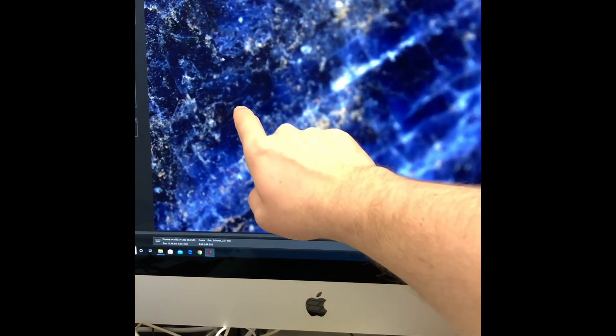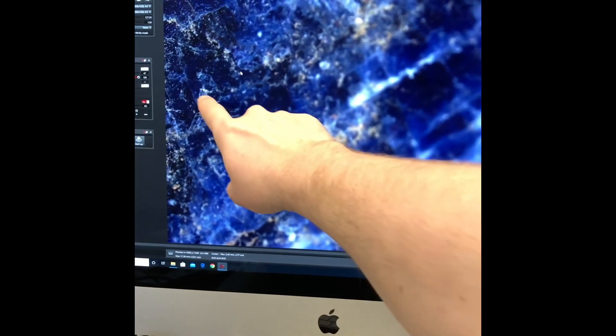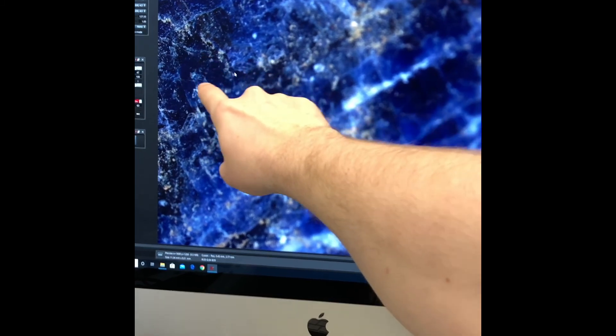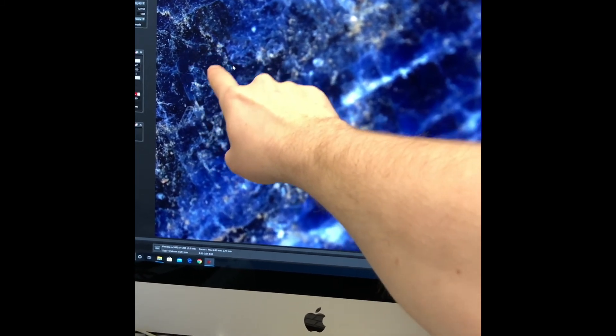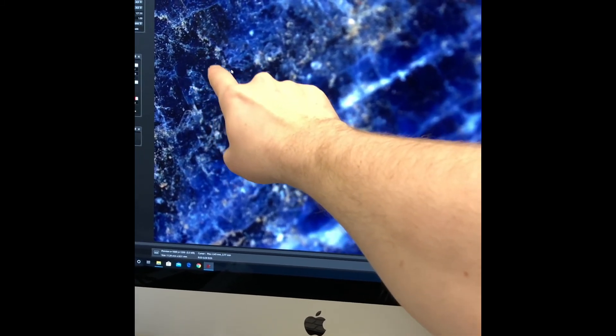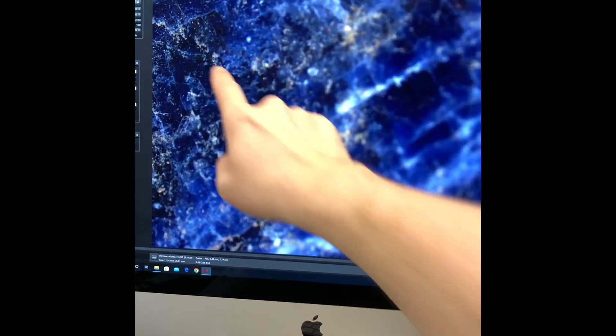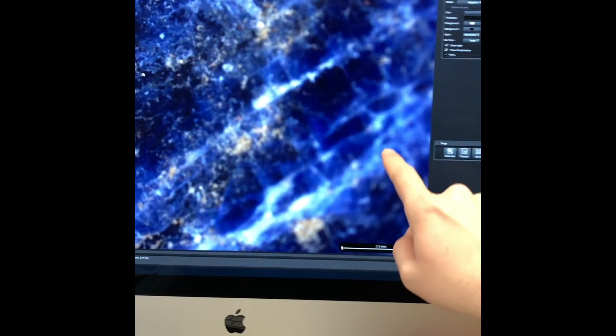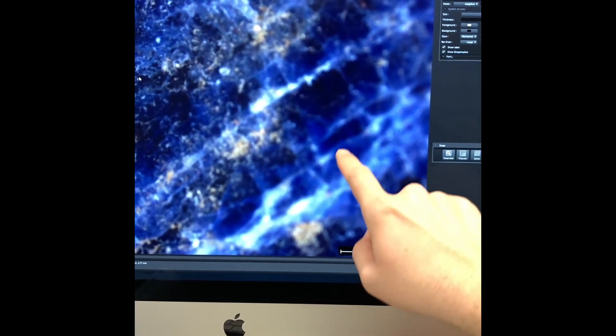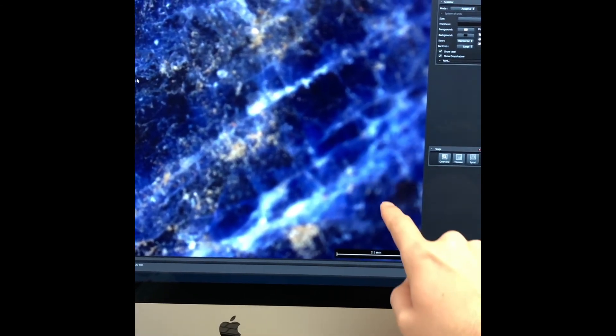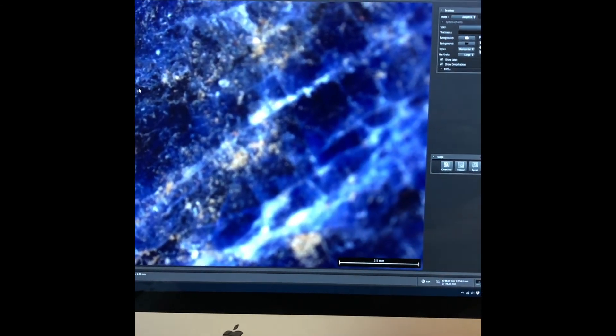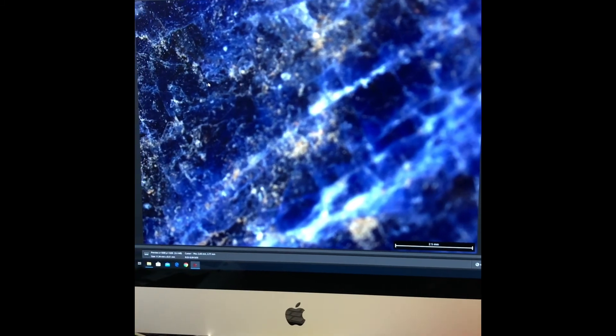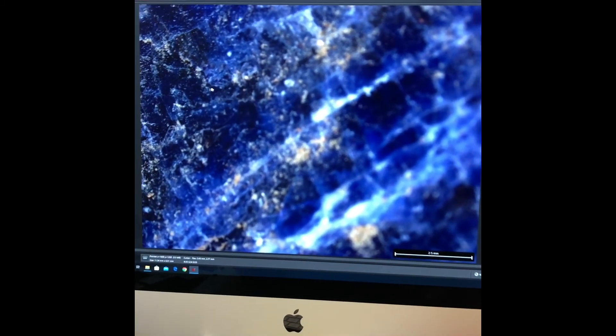As we can immediately see, this area over here is in great focus and is very crisp and clear, whereas this area over here is pretty blurry. Overall, this would not be an acceptable image.